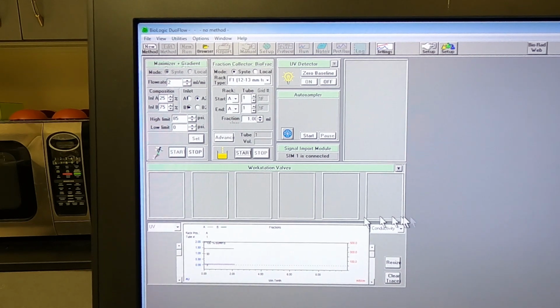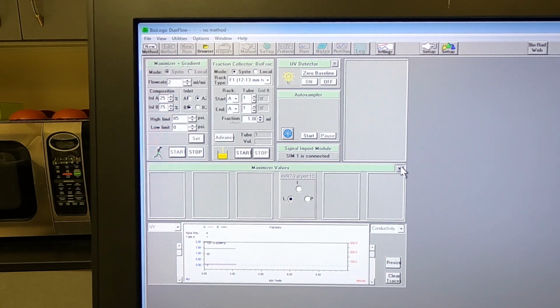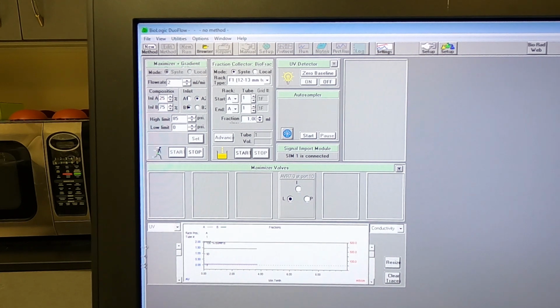Here in the center we have our workstation valve controls. So you may not see them, but if you push the drop down arrow, it will show the inject valve that we have, AVR 7-3. Again, 7 is the number of ports, 3 is the number of positions. So here's our 3 positions: L for load, I for inject, P for purge. And at the bottom here, we see a small chromatogram.